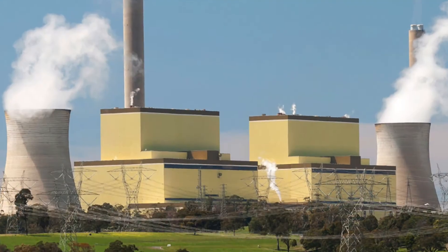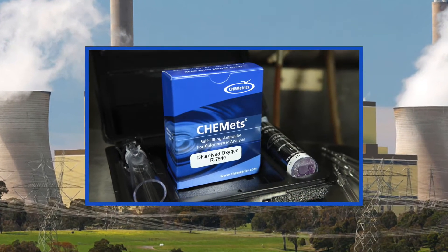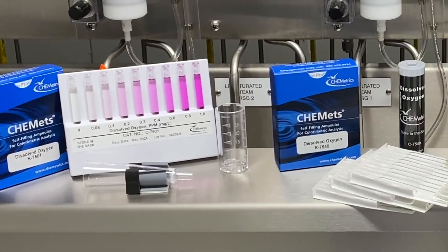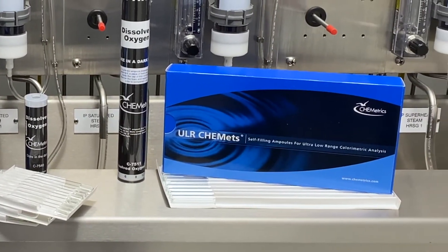For the testing of dissolved oxygen, analysts may rely on the Kemetrix line of accurate, dependable, easy-to-use kits. They're available for the testing of DO in the high, low, and ultra-low ranges, and all kits employ the Rhodazine D method.